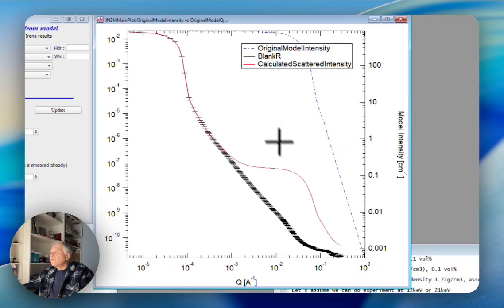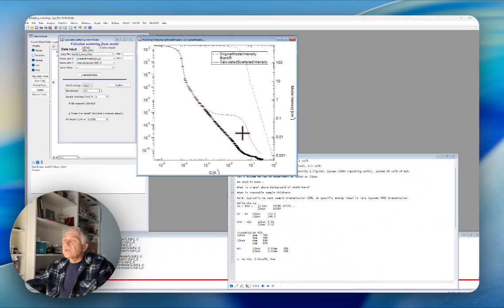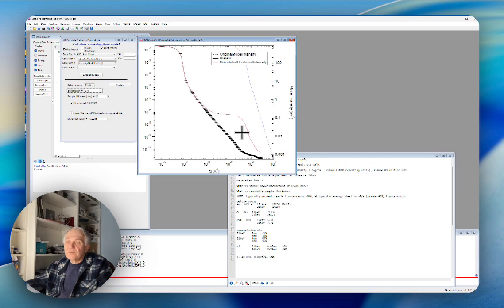So you have quite significant scattering here above your sample. So if you can calculate and show me this, yes, we can measure your samples very, very easily.